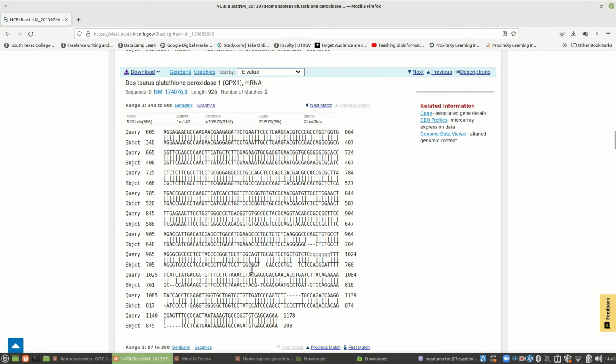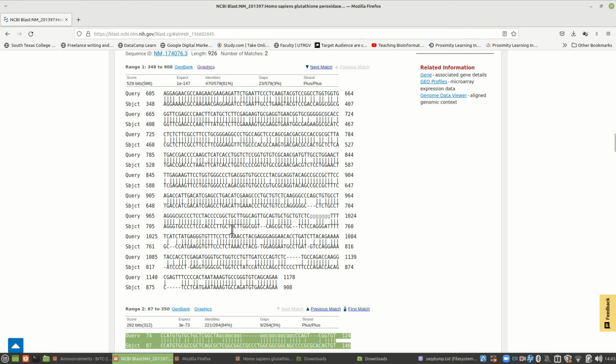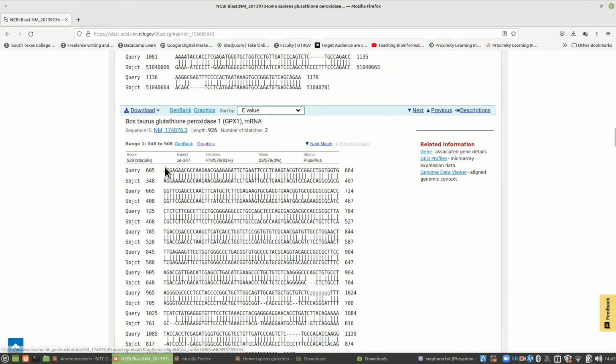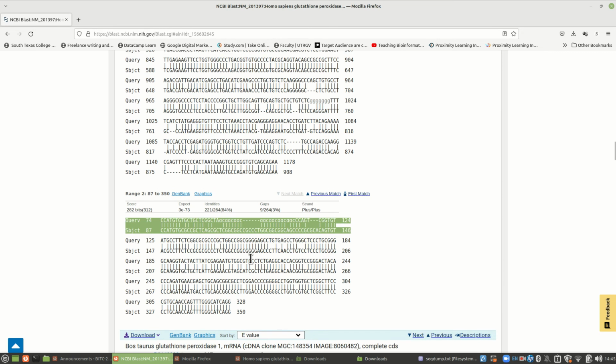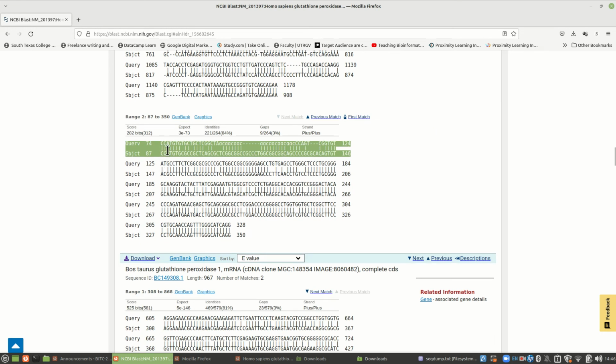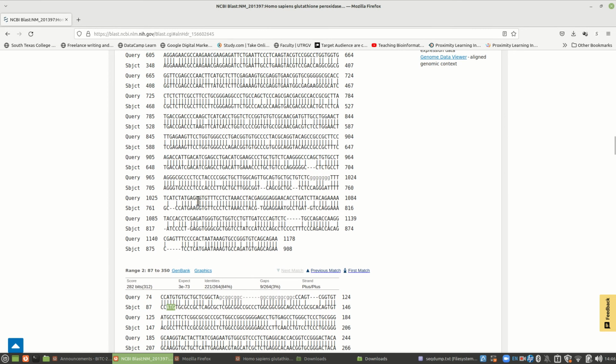So look through here. Now it would also be interesting to find out where the start and stop codons are and the splice sites. If you've done the previous part of your sequence, you can find those here in your sequence, which I suppose is the top one here, the long one, 1000, yeah, the top one. So you would go through and find your start and stop codon. Probably it's ATG right here. All right, that looks to have stayed the same. So report that.